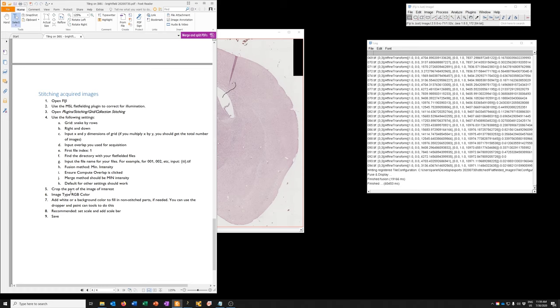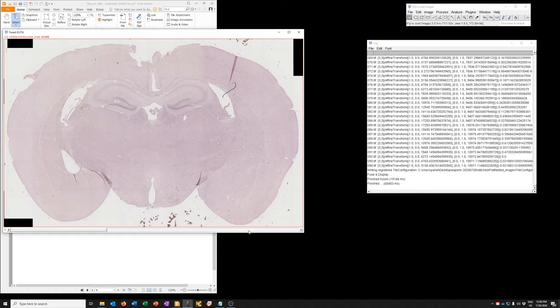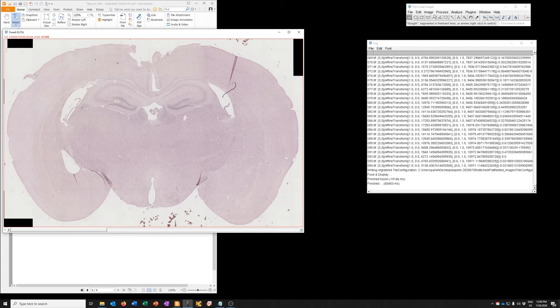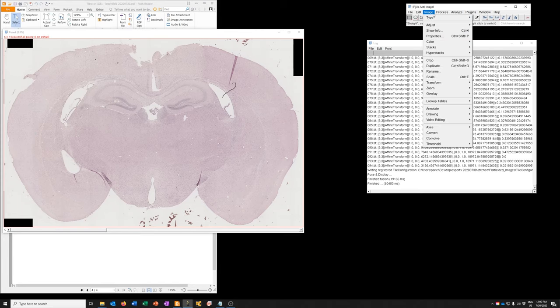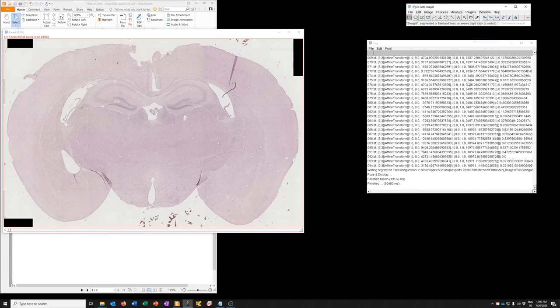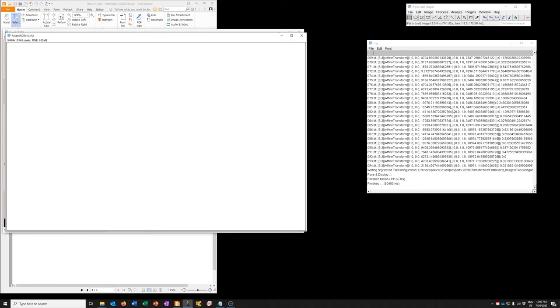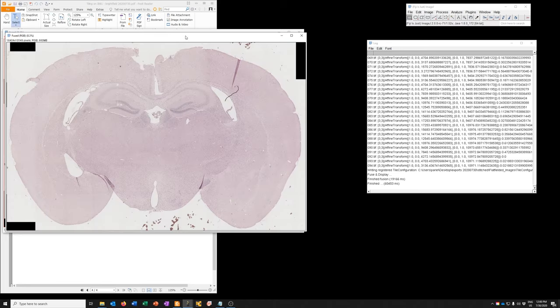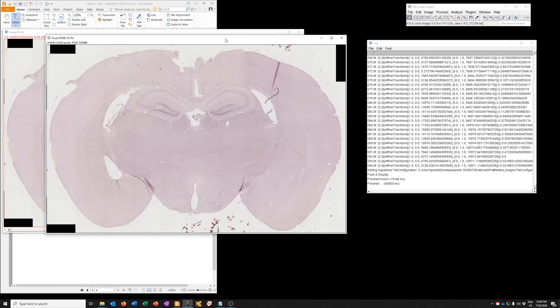The next step is to do image type RGB color. So this image has three channels which are independent. We don't want that. We just want to go to image type RGB color. And so it'll make an image where the channels are all merged.